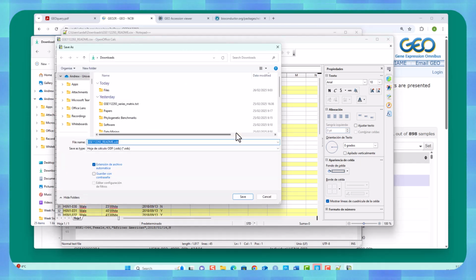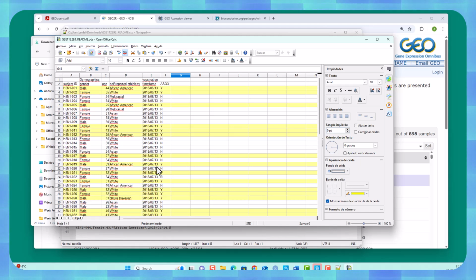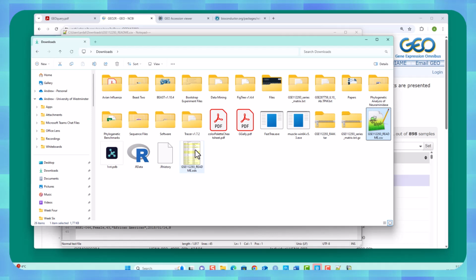It's also saved it as open ODS. Okay, then do it as an ODS. I don't really care. I just want a saved file. So what's it done? Just saved the ODS? Yeah.